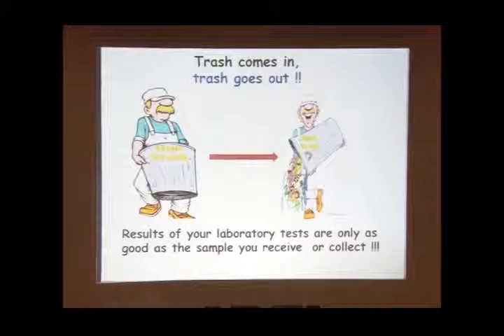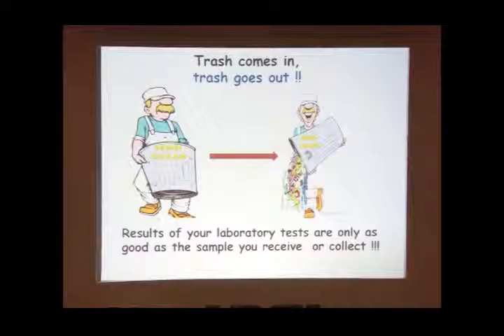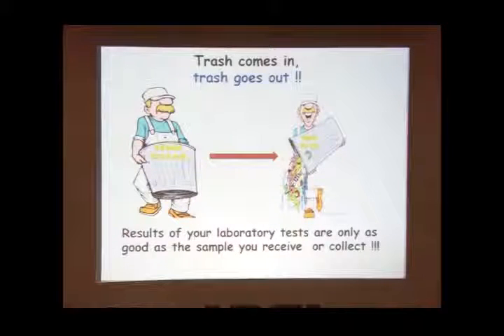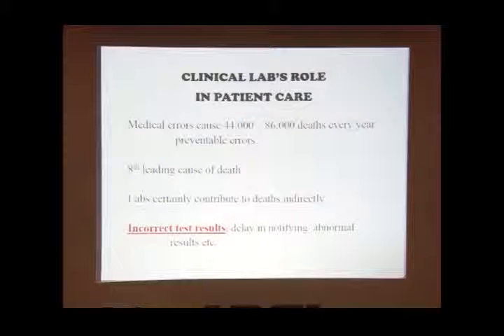We all know that the quality of the lab result that you give depends on the quality of the sample that you receive or the quality of the sample that you take for analysis. If you take a bad quality sample, then no matter how good you are and how good your analyzers or techniques are, you are still going to get bad results. So if trash comes into your laboratory, then only trash goes out. This is where the lab has to look at the pre-analytical stage.